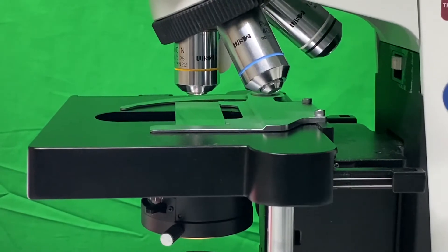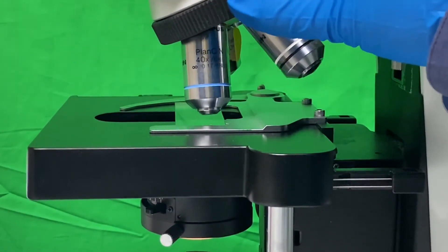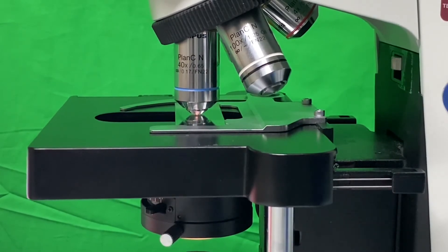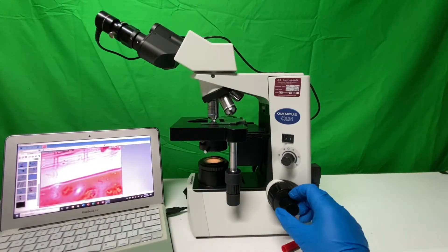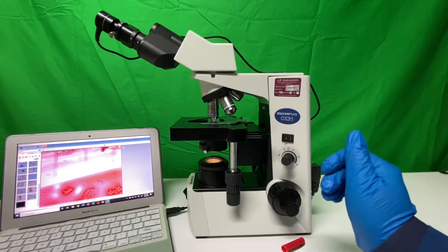Let me get in close so you can see how close the 40x objective gets — it's really, really close to the slide. Zooming out, you can see the image is still relatively in focus, and then with just a minimal fine adjustment we'll get the focus we want.